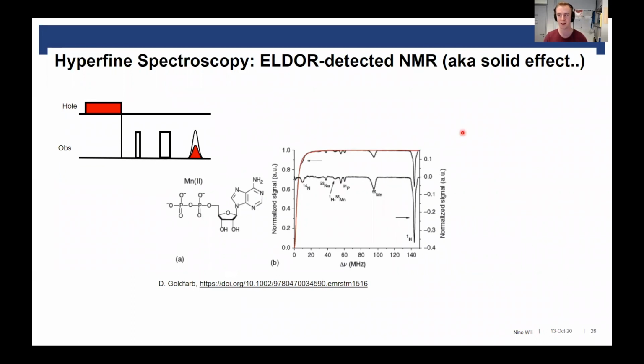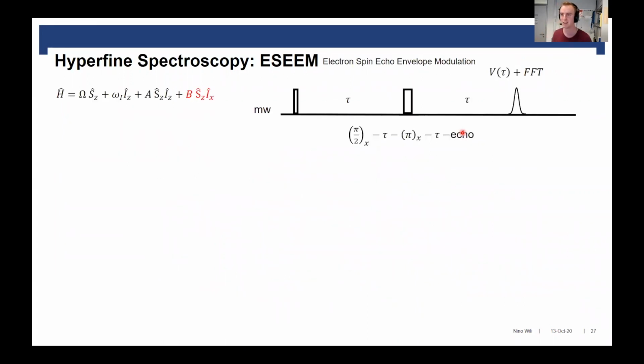And we talked about ELDOR using polarization transfer via the forbidden transition. And now the more complicated subject is that they also have an effect on coherence transfer. And because we're already at 47 minutes, I would like to shorten this quite a lot and just describe the problem, and not what you get out too much, or how it's exactly done.